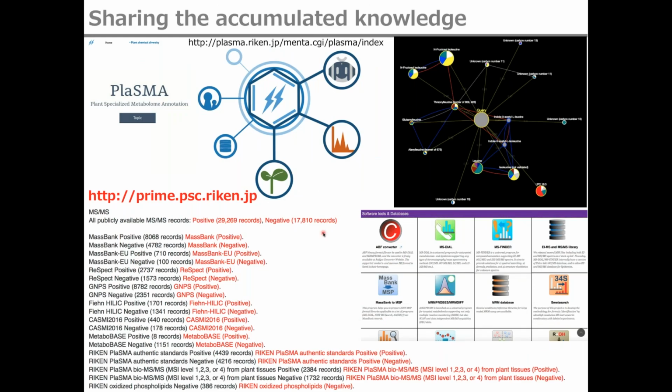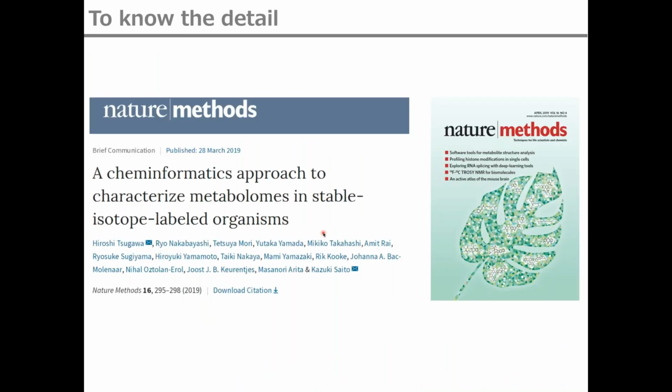And finally, all of our databases and programs are shared on our RIKEN PRIMe website, and you can search your unknown queries in our newly created web server. And all of the details that I introduced today are summarized in our latest paper. And again, thank you so much to all of the collaborators who contributed to this research.